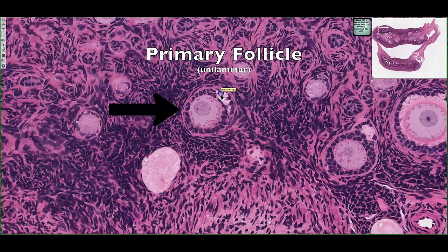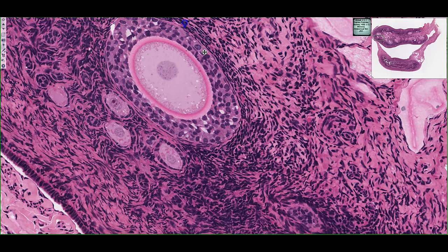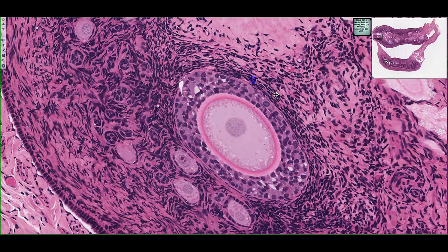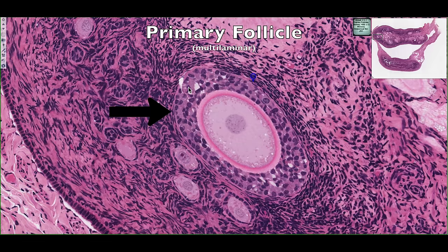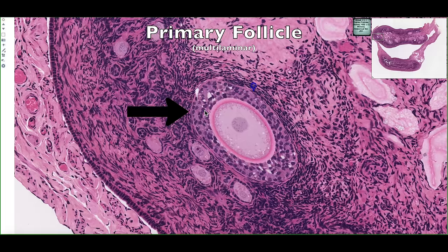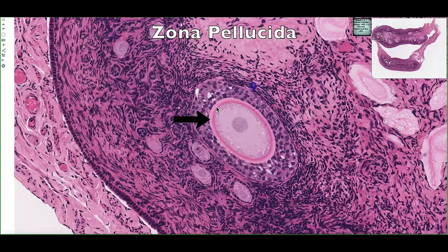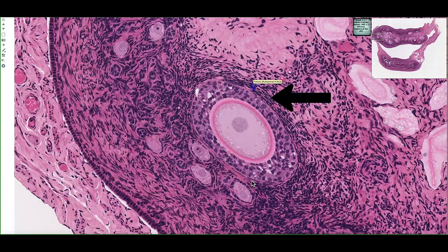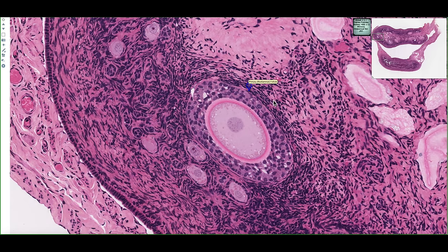Eventually, this primary follicle is going to develop multiple layers of these follicular cells. If we look at a multilaminar primary follicle, we can see that it has multiple layers of these cells. These cells are no longer called follicular cells — they're called granulosal cells, forming a layer called the stratum granulosum. Here we can see the oocyte with its nucleus, and separating the oocyte from the granulosal cells is a dense glycoprotein-rich structure called the zona pellucida. Surrounding the multilaminar follicle, layers of stromal cells begin to surround and become more developed, becoming more prominent as we look at a secondary follicle.